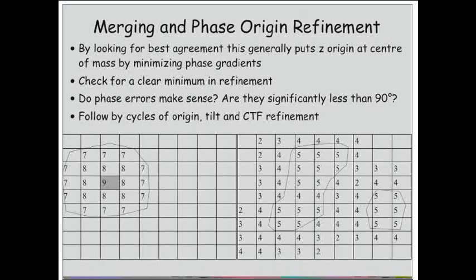You're getting similar scores spread over quite a large array of different phase shifts, and it's not clear whether the peak should be in here or here, and sometimes you can get them streaked out. It's very ambiguous. The program's always going to try and find the minimum. By definition, that's what it's being told to do, but it doesn't mean that it's giving you the correct value.